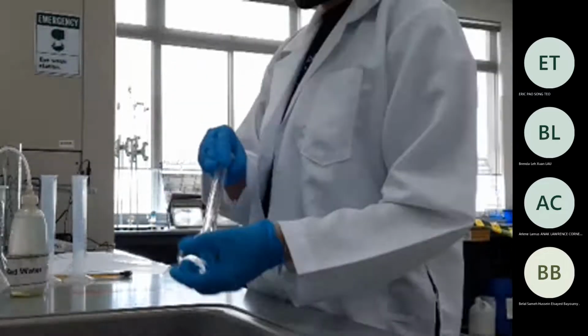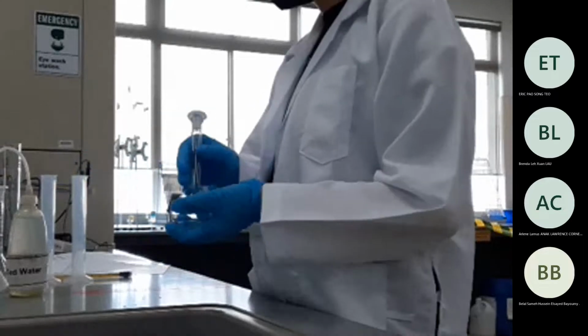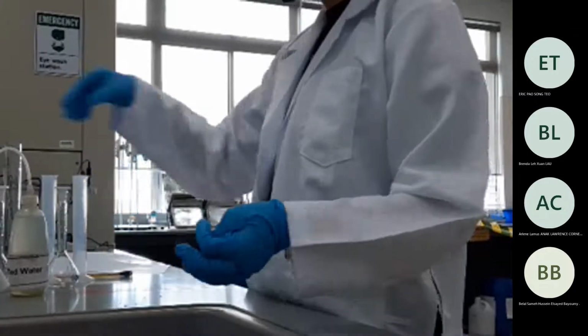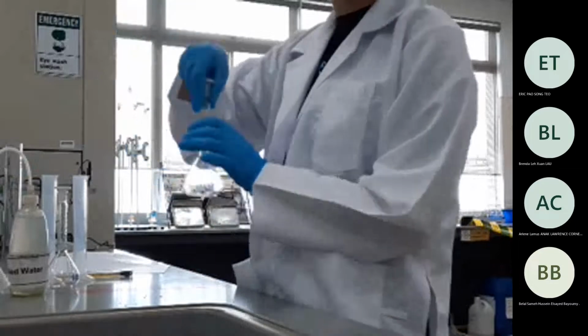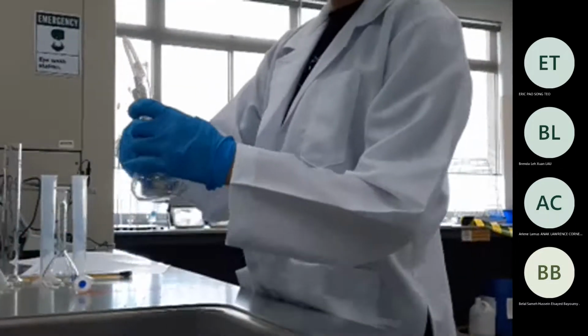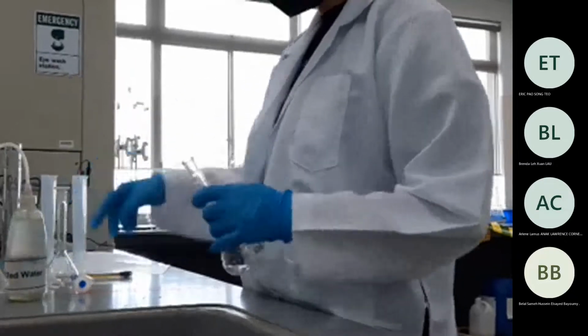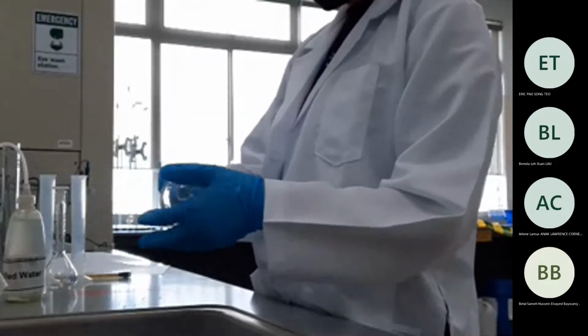I think I should take the gloves for myself as well. This is just distilled water? Yeah, it's just distilled water, it won't corrode your skin. No, it's not. But the safety procedure is we should be using gloves.